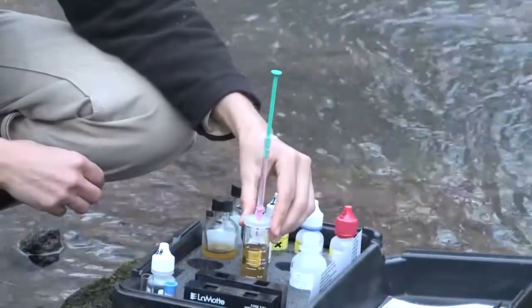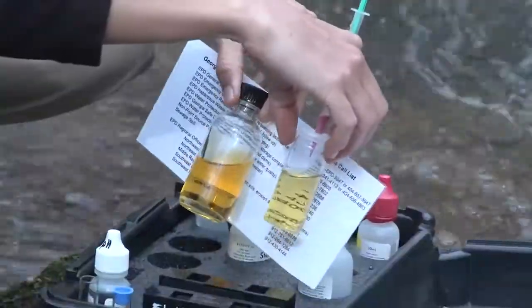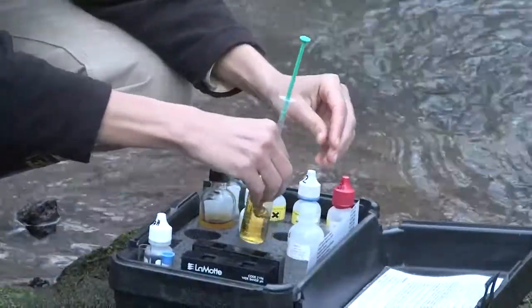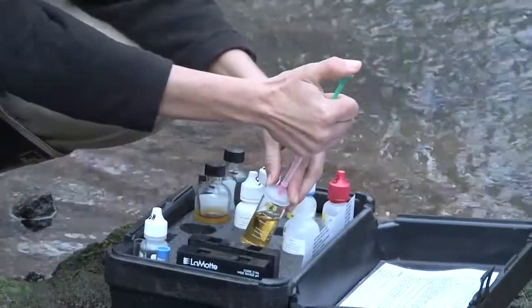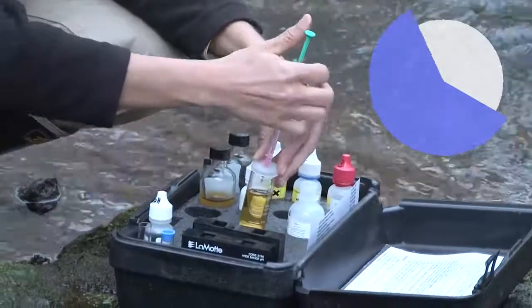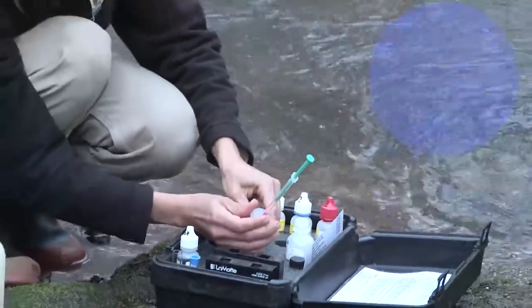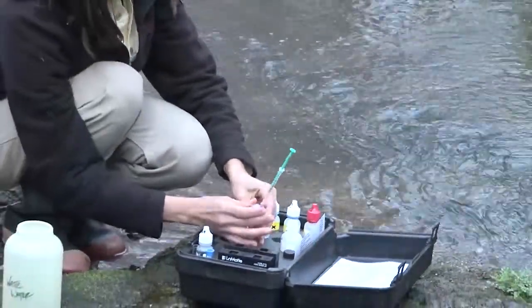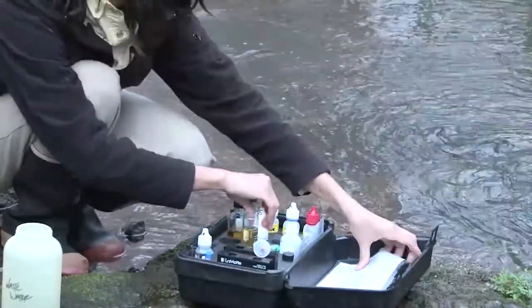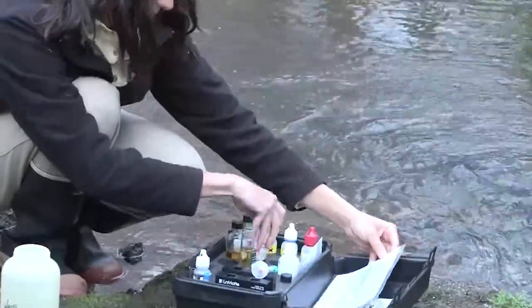Tara adds one drop at a time and mixes the solution after each drop, until the liquid becomes a pale straw color. When dissolved oxygen levels are high, it will take more drops to reach this color, and you may need to refill the titrator with more sodium thiosulfate. With the titrator still in place, she carefully removes the cap and lays it on its side to keep the cap clean and not lose any of the chemical.